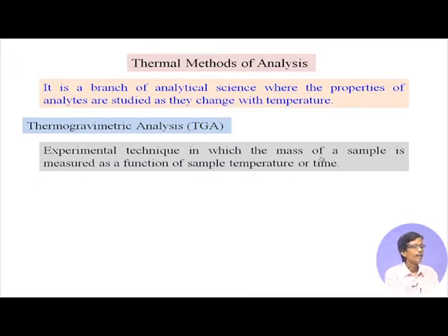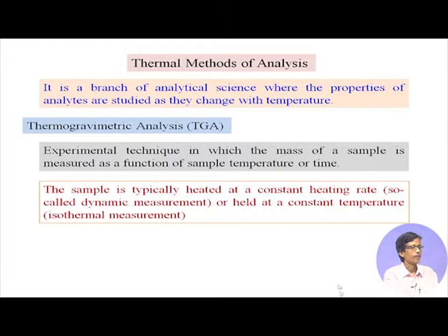So, what we get is that the mass of the sample is measured as a function of sample temperature or time. Either you monitor the mass loss with the rise in sample temperature, or sometimes we can also see that if we cool it in a reverse way, there can be some mass gain. And if the heating rate of the furnace holding the sample over the balance is synchronized with our temperature rise, that means the rate of change of temperature with time is synchronized, we can also plot against time instead of temperature.